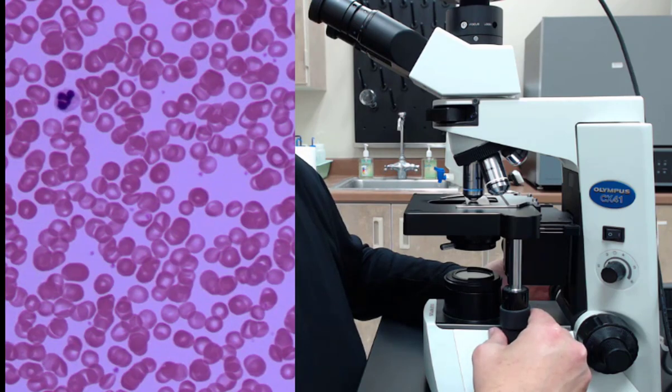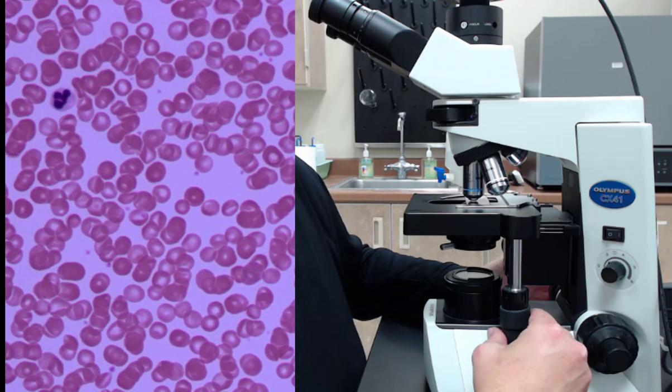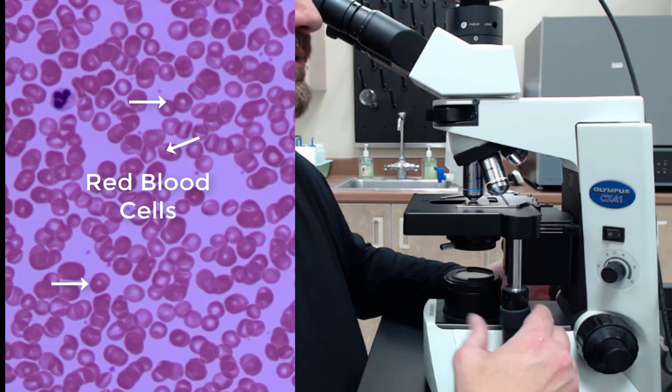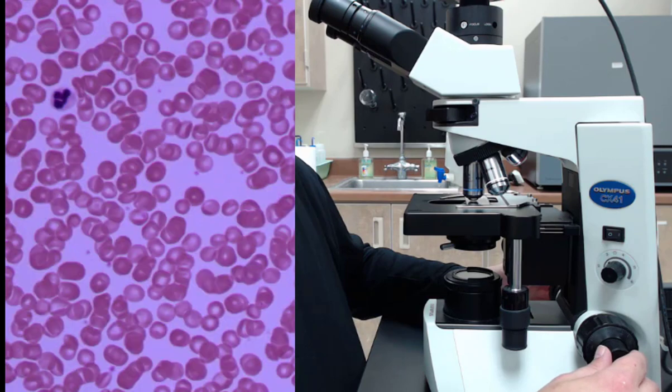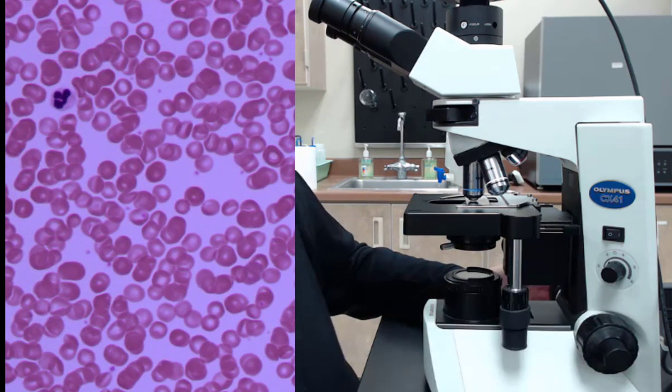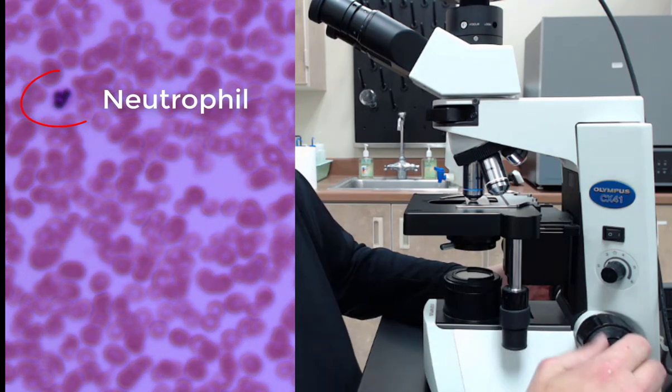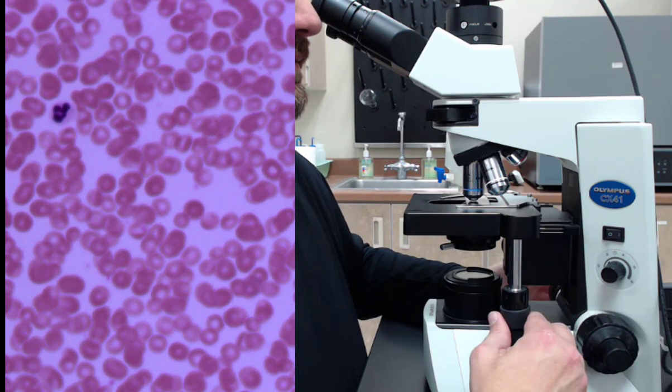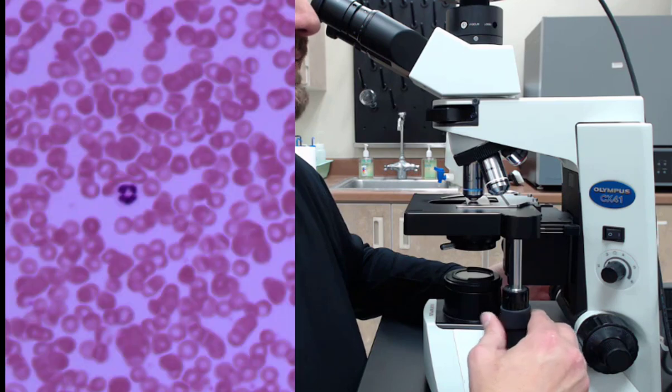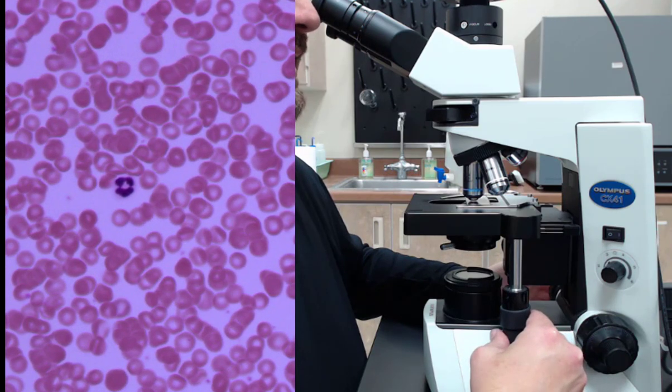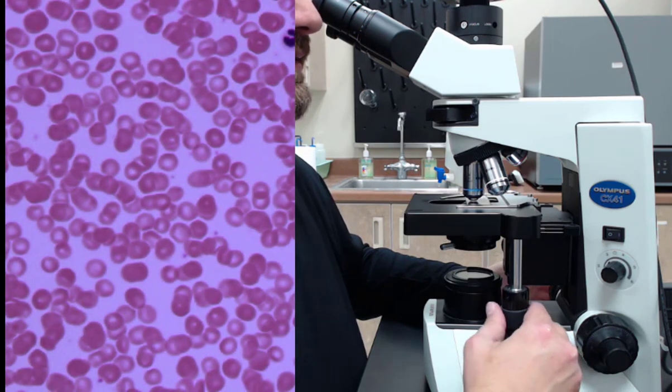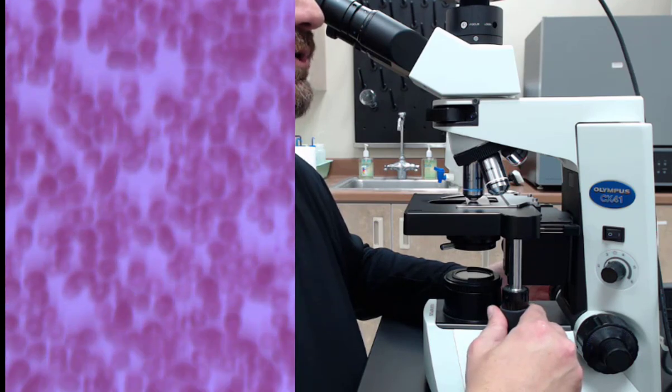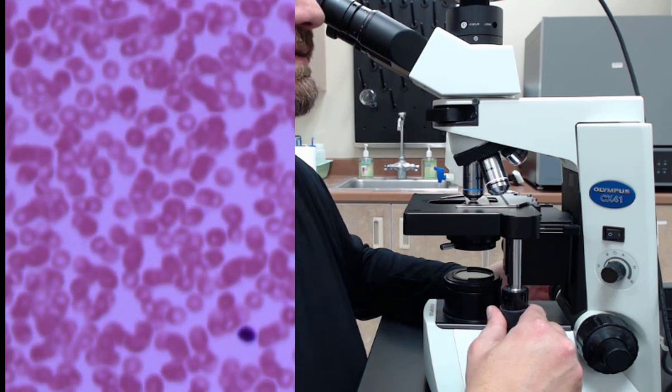Now we're starting to have some structures that I want to center that I really want to get a good look at here. So I'll actually just annotate in the video which types of white blood cells we're looking at, but I have it in focus as good as I can get it. So what I'm going to do now is just scan around a little bit and let you see what some of these white blood cells look like here at this high dry power. So I'm just scanning around. I'll kind of highlight things that you're seeing. But we're actually going to move on then to the oil immersion lens system.